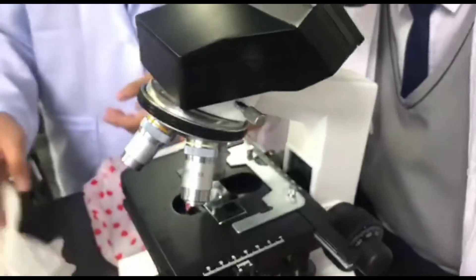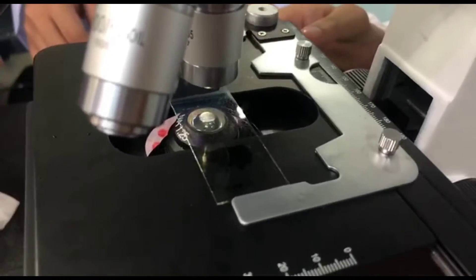Then move the coarse adjustment to get the clearest possible image of the protist.